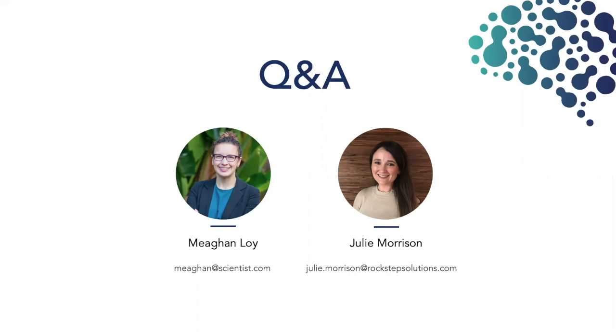Do you experience all study directors and managers interacting with the system, or do you end up targeting a few with the right mindset that become responsible for all of the studies? Yeah, I think in general, it's better when everyone is using the system because each person has their login, each person has their own audit, and it becomes generally more efficient. Obviously we're trying to improve processes and efficiencies, and it really helps when everyone is on target.